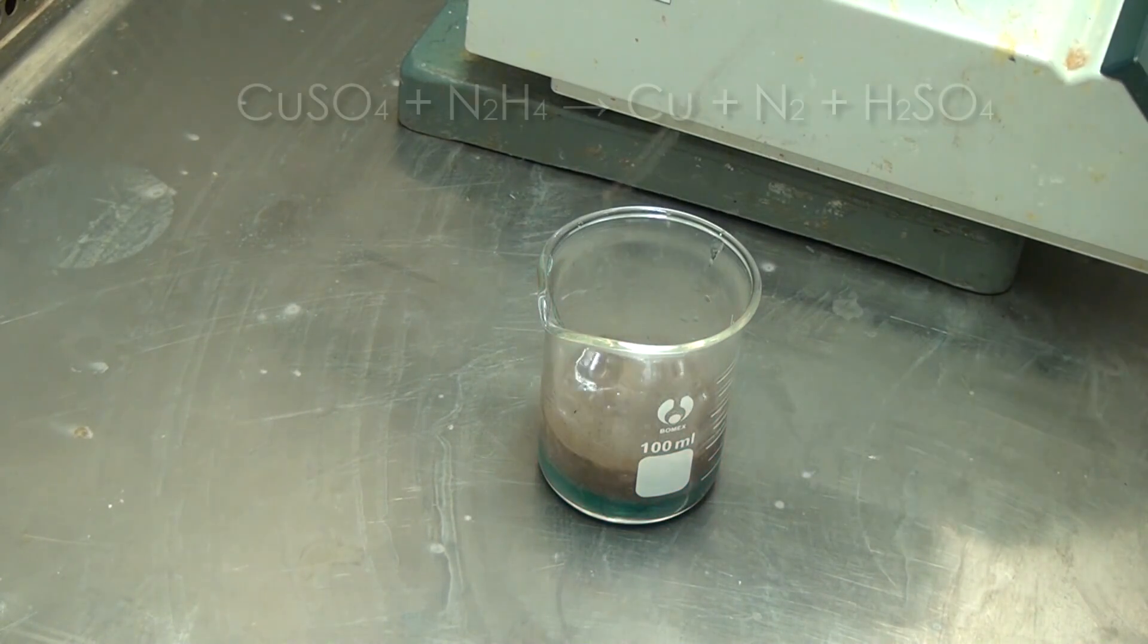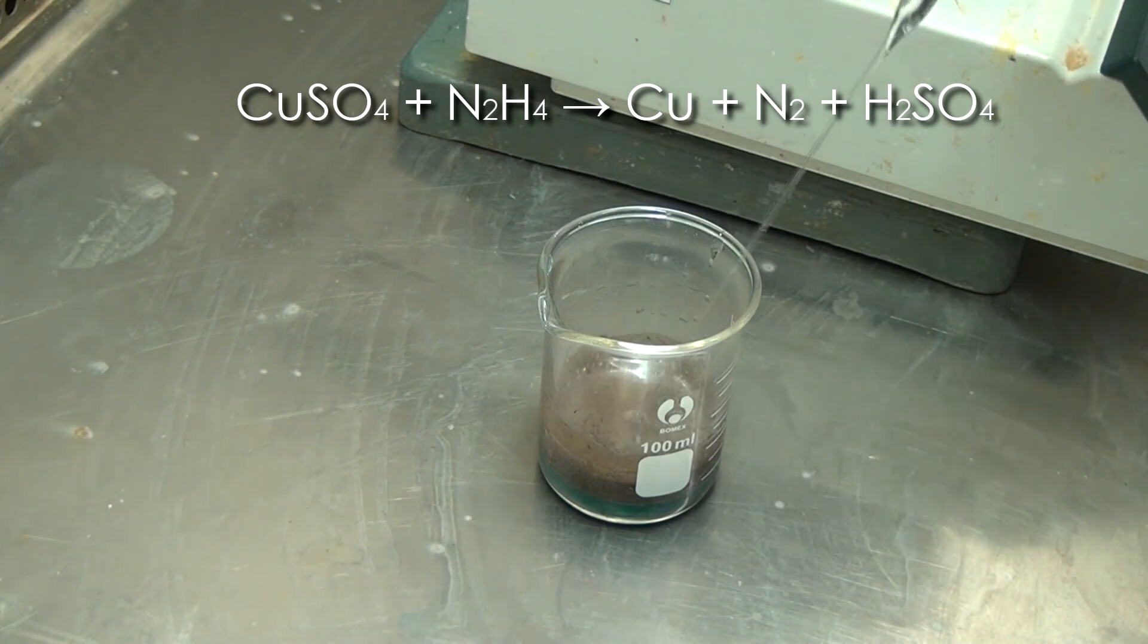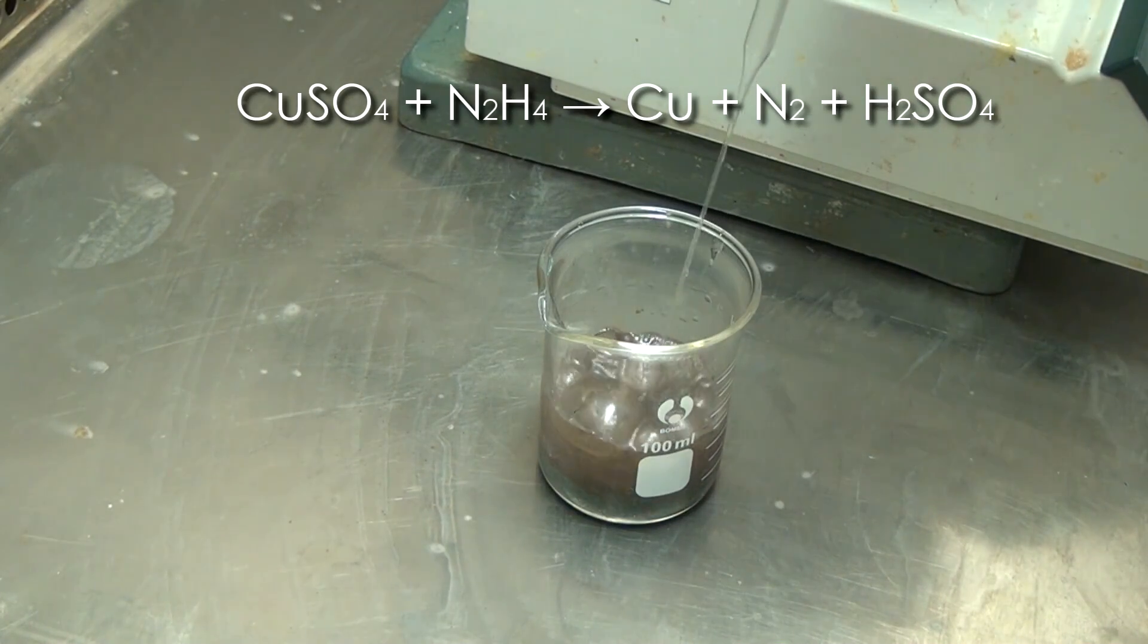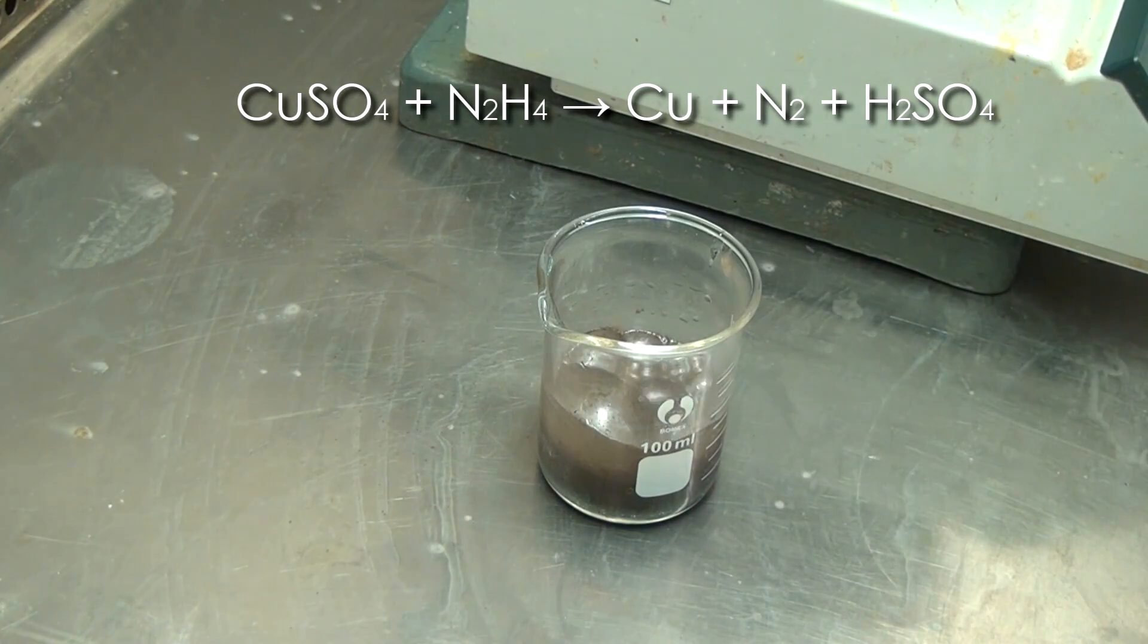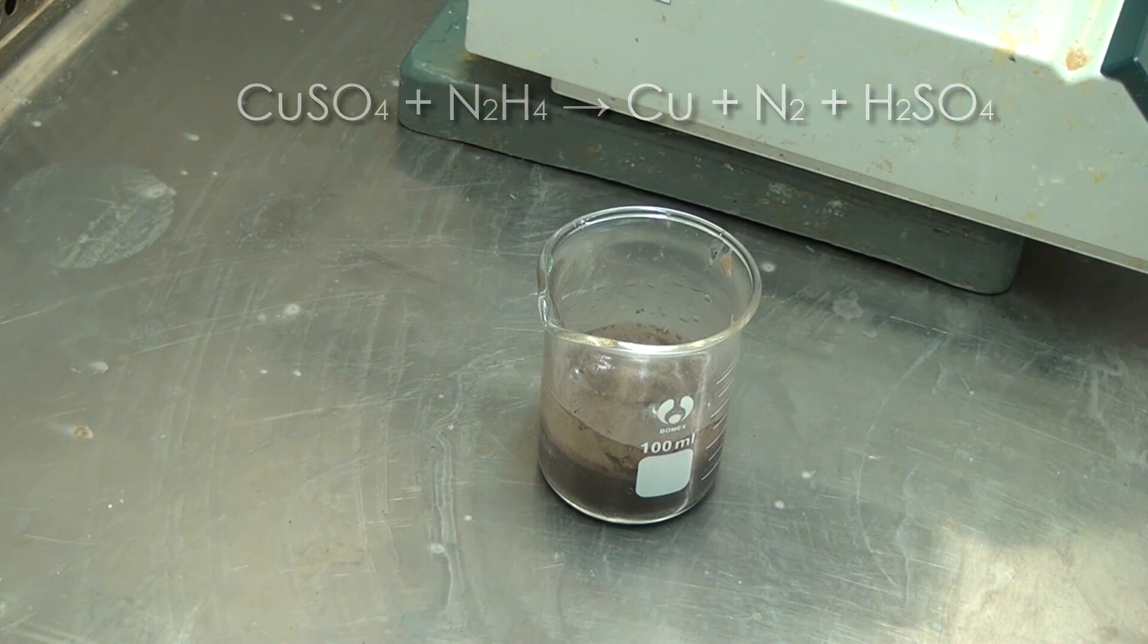Immediately we can observe a reaction in which nitrogen gas is released. Small particles of copper begin to form in our beaker. Hydrazine is a very good reducing agent and recovers copper from divalent to the metallic state.